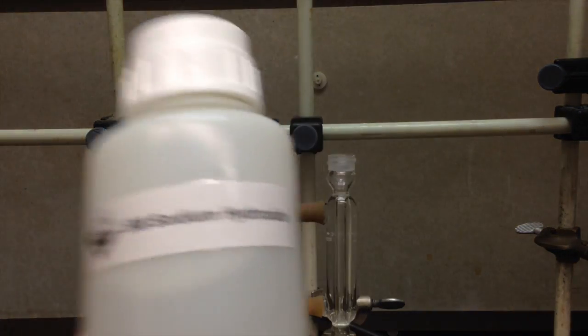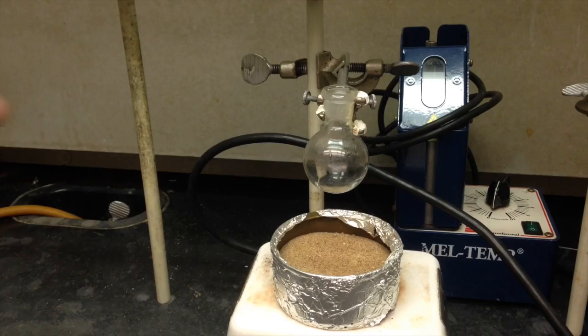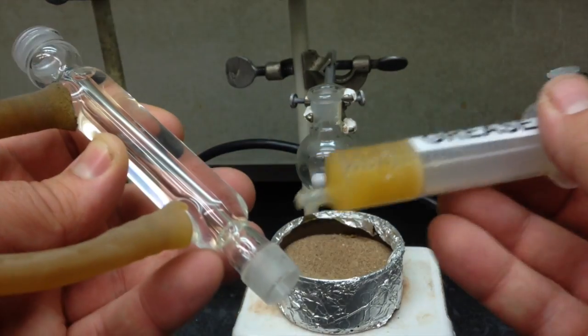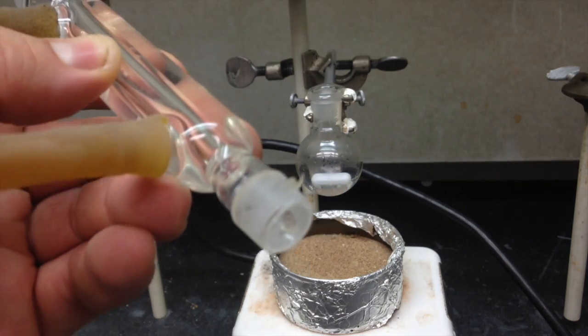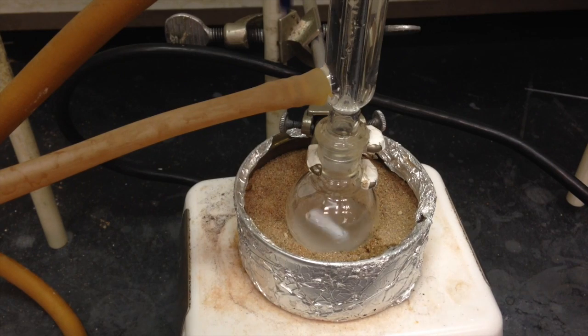Next up is the sodium hydroxide. Remember, if you get any of this on your fingers, when you go to wash your hands it'll feel slippery — just wash your hands until they feel clean again. If your reflux condenser still has the cap and O-ring from last week, make sure you take that off. For today's experiment, you're going to need to grease the edge of your reflux condenser. You only need a little dab, a few points around the edge, and then just turn it around inside your round bottle.